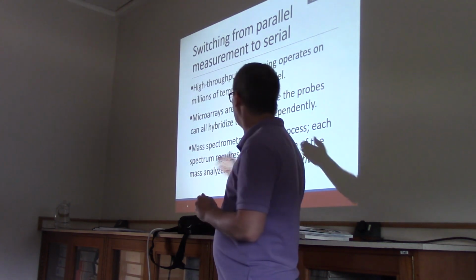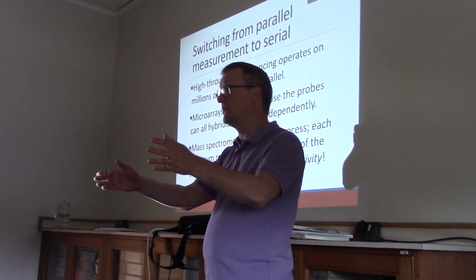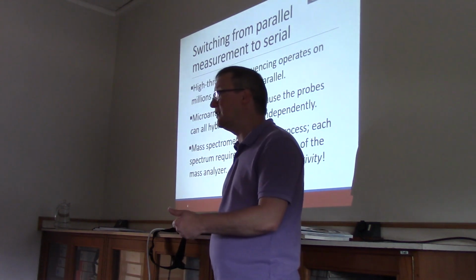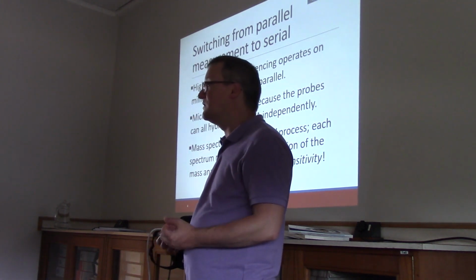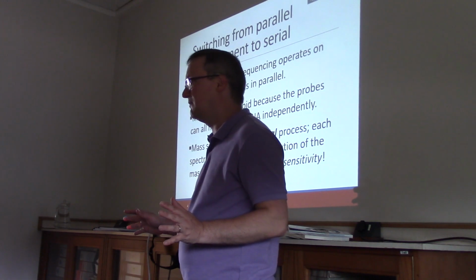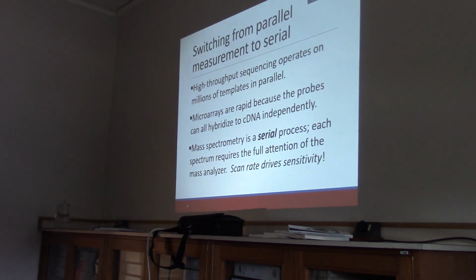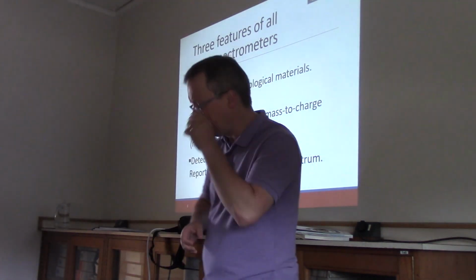Very frequently, the case in proteomics is that we trade instrument time to accomplish more sensitivity. So if you're trying to do an experiment in a 2-hour block, you're going to see maybe a few thousand proteins, but you're not going to see typically tens of thousands of proteins. These numbers change from year to year because mass specs keep getting better. But I wanted people to have that appraisal on that. All right, so what is a mass spec?